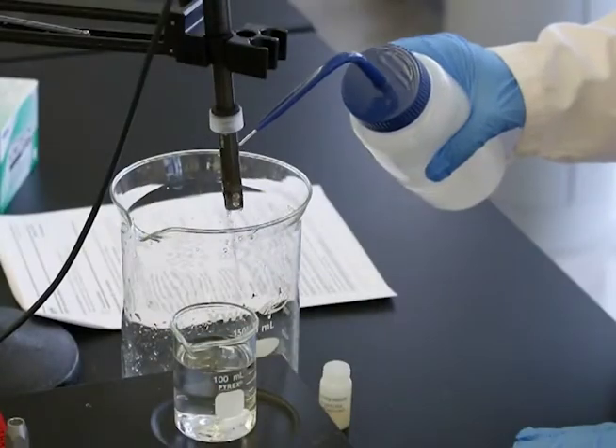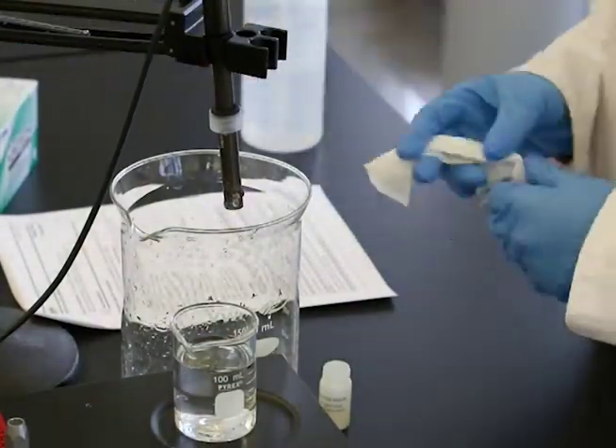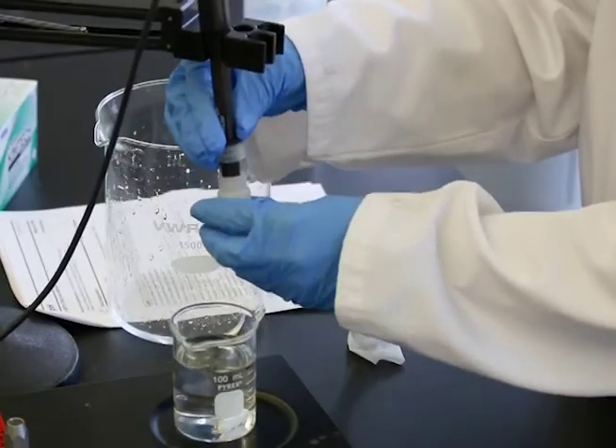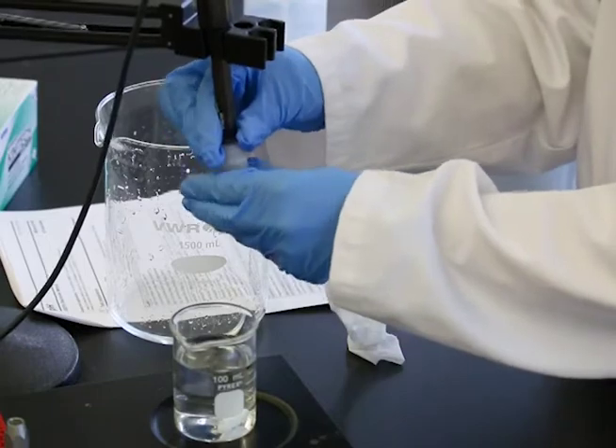Record the values for pH and temperature. Rinse the probe, dry it, and place it back in the storage solution when measurements are complete.